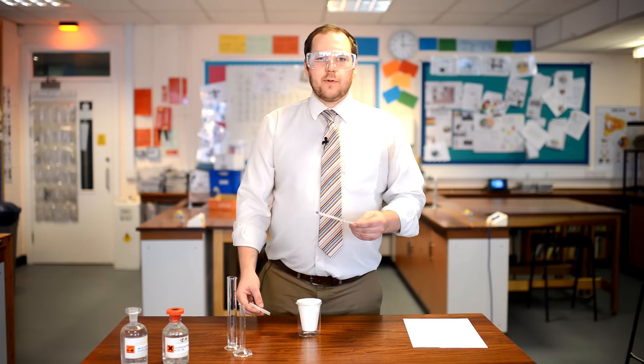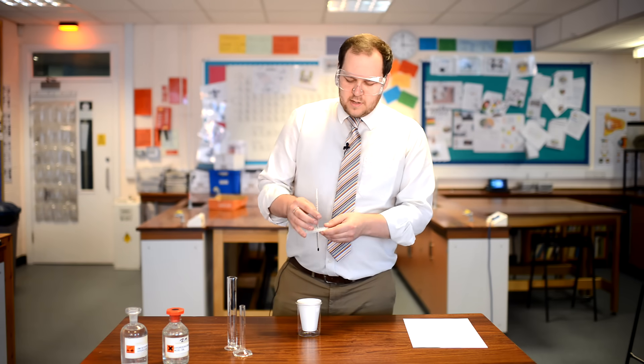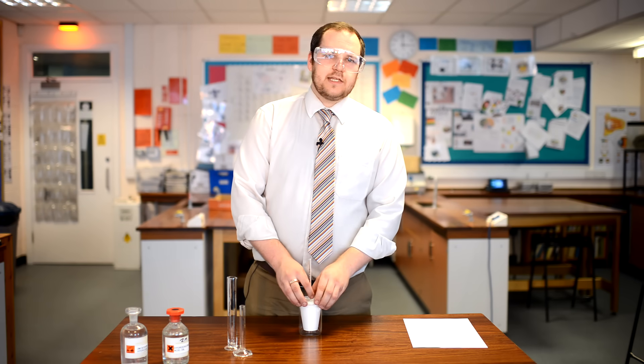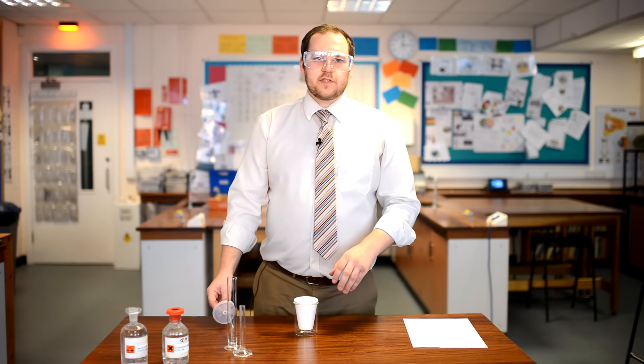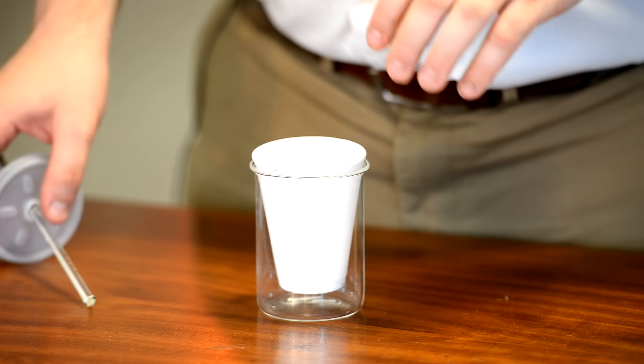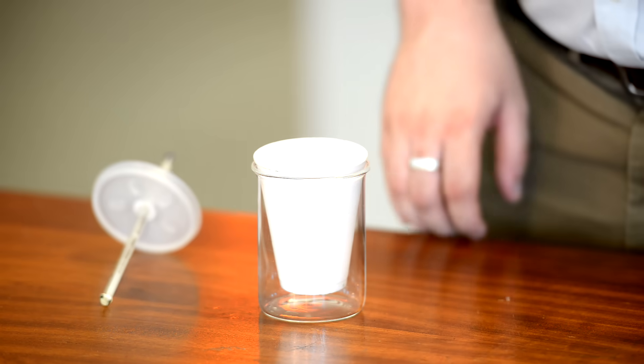The next thing you're going to do is take your thermometer and pop a hole through this lid, and make sure that it sits in nicely into the cup without going through the bottom. We're using a polystyrene cup and lid because less heat will escape from either out of the top or out of the sides of the container.